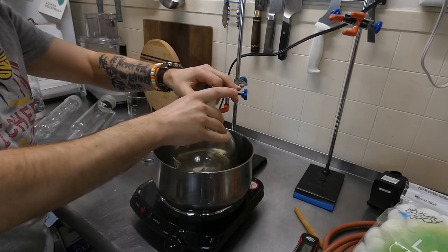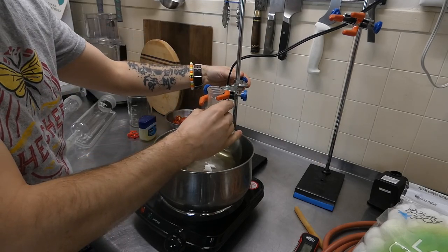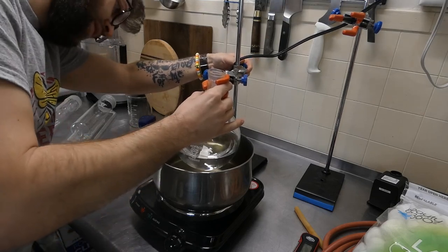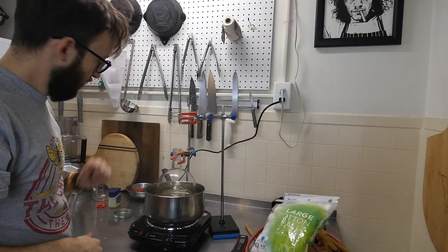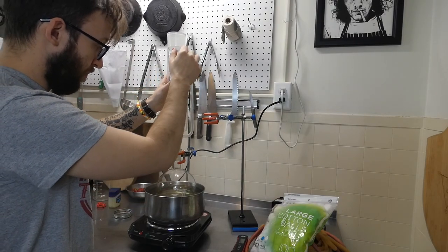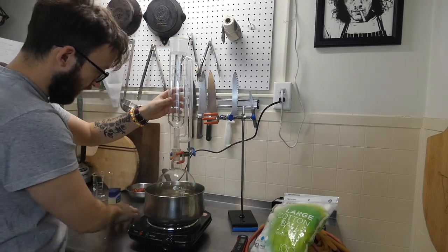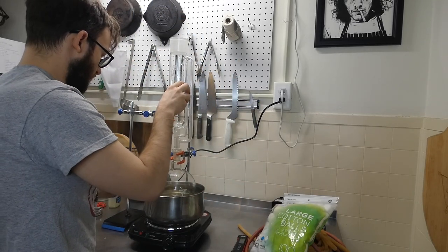And you wanna make sure that it doesn't touch the bottom. So we're gonna have to raise this up there. But right now I'm just gonna clamp this down for a second, and we're gonna raise this up so it's just touching the oil. All right, so we've got that in. Now you're gonna take your joint that's greased up, and you're just gonna pop that in there and turn it as you do. And that will ensure that it's not gonna stick. And then we're just gonna pop this over here to help support this.